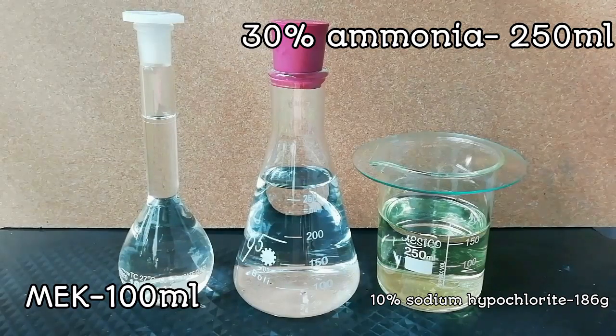Liquid hydrazine is a very flammable, toxic, and dangerous chemical compound. Hydrazine sulfate, however, is stable and safe.